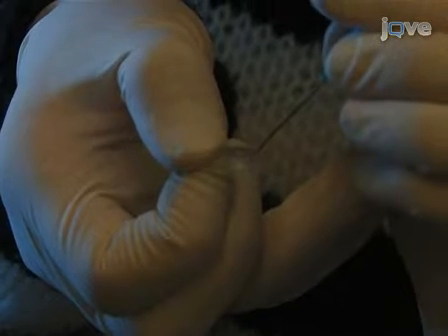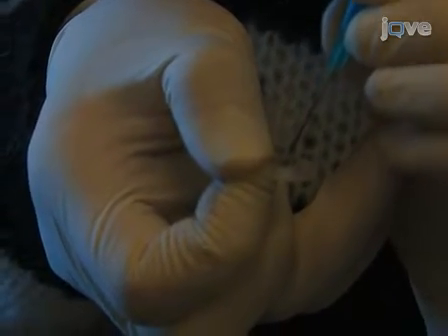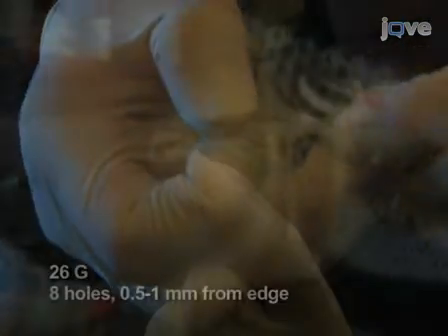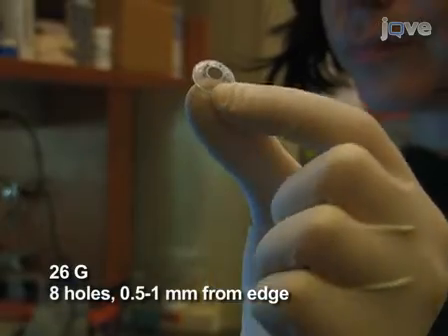Using a heated 26G needle, make 8 suturing holes by puncturing from the outside to the inside of the base. The holes should be evenly distributed around the cover slip, 0.5 to 1 mm away from the edge of the cover slip.